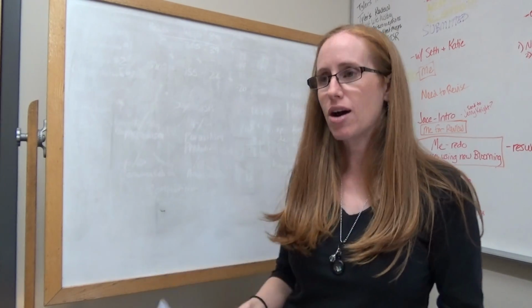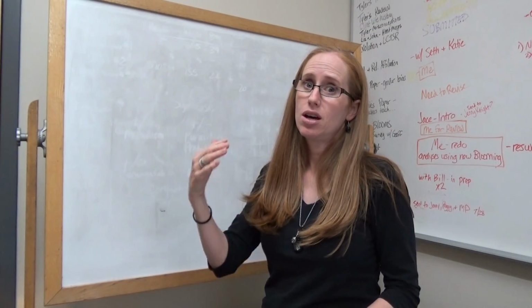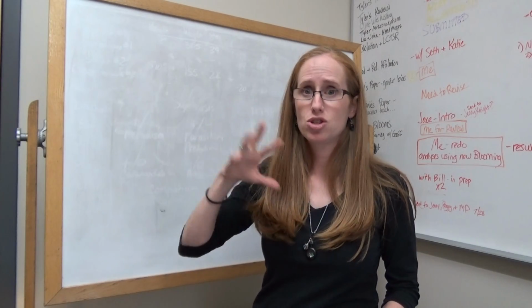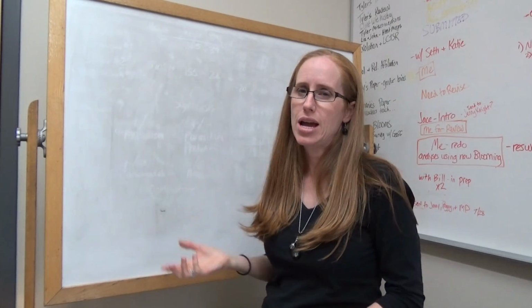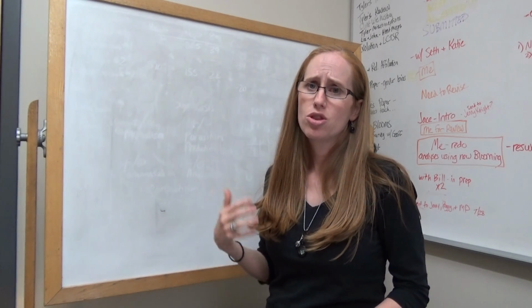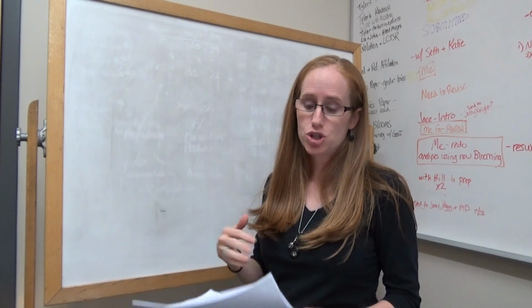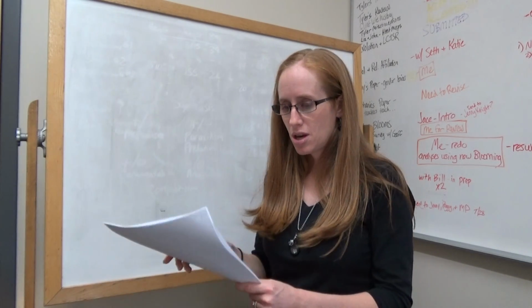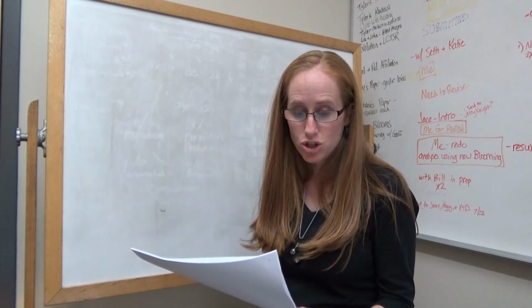All right, so you're going to start out by having them all go get their jars, and hopefully each group had a big and a small jar and a vestigial and a normal winged fly in the different jars. So you have some variety in your groups. It's okay though if you don't. They are going to share throughout the classroom, so it's not that big of a deal, but it would be nice if at their table they have a couple different jar types or fruit fly types. Alright, so have them just read the introduction to the lab and then do number 1.